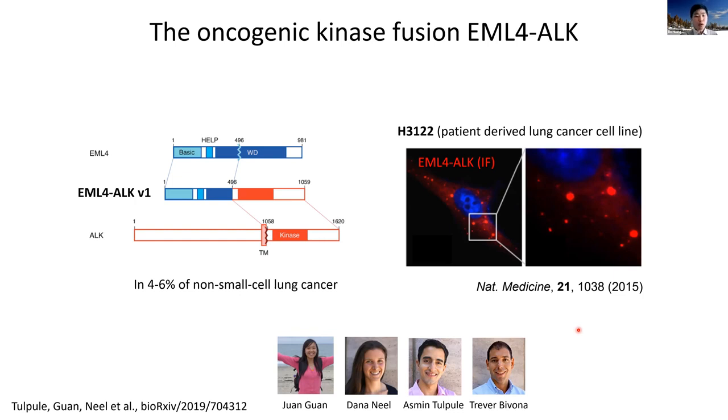To make a very long story short, we've shown that those clusters we see on the microscope are phase-separated protein granules coming from the multivalent interactions mediated by EML4-ALK protein and the GRB2 adapter protein binding.